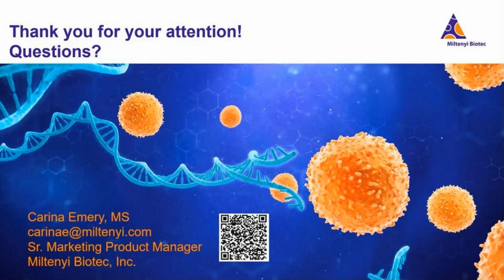When I recorded this webinar, 10x had not yet released a protocol for FFPE on their fixed RNA profiling kit. However, they have recently released that protocol, and it does use the Miltenyi FFPE tissue dissociation kit upstream to dissociate the FFPE tissue.